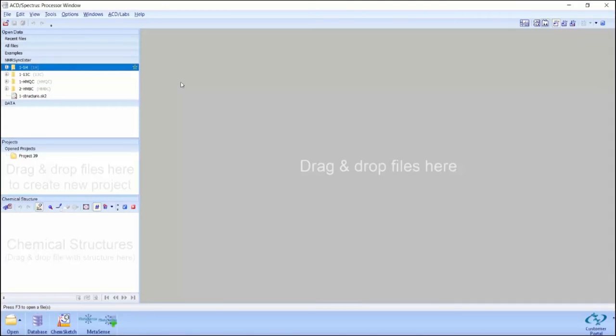This video will demonstrate how to process multiple NMR spectra simultaneously using NMRSync in ACD NMR Workbook. With this feature, you can process your data even before your final spectra has been finished being recorded. It will allow you to transfer your peak picking between multiple spectra, saving the user time.